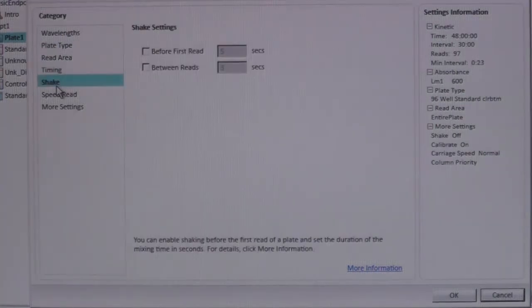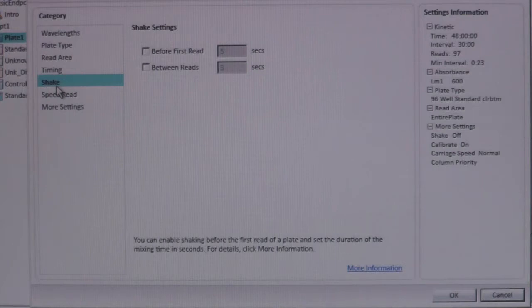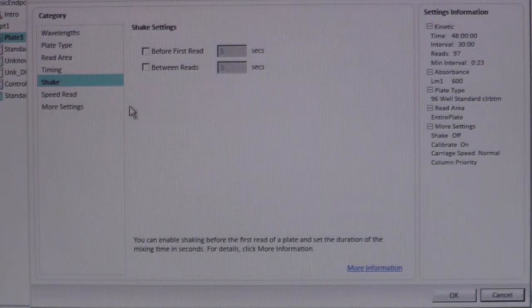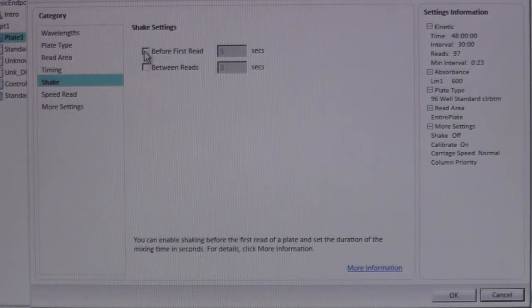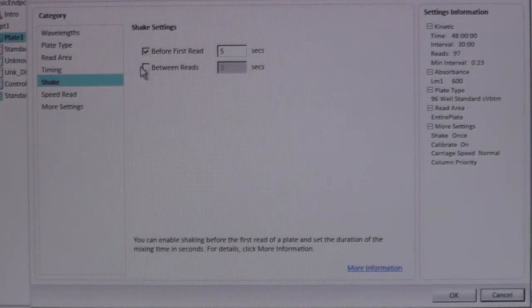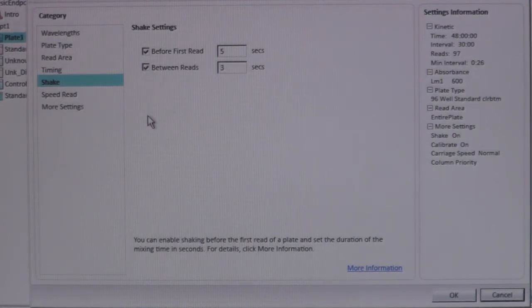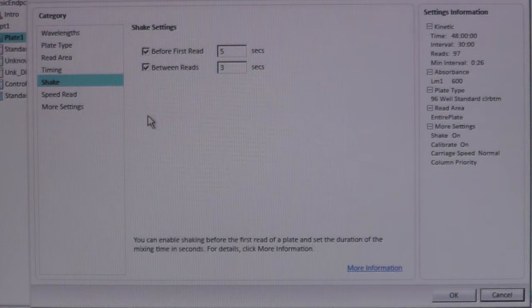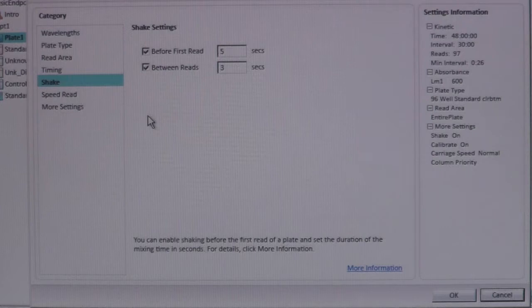There is also an option to shake your plate prior to each reading. This is good to include as it helps disperse any cells that may have settled to the bottom of the well. To add the shake option, select both boxes. 5 and 3 seconds for before and in between reads are the default settings. You can increase or decrease these periods as needed for your experiment.